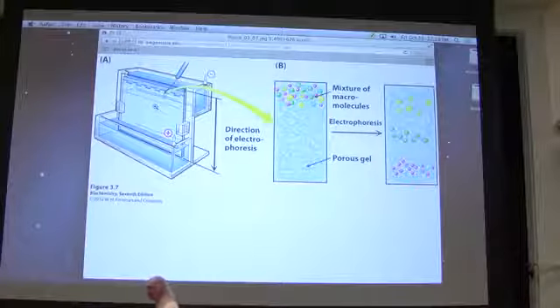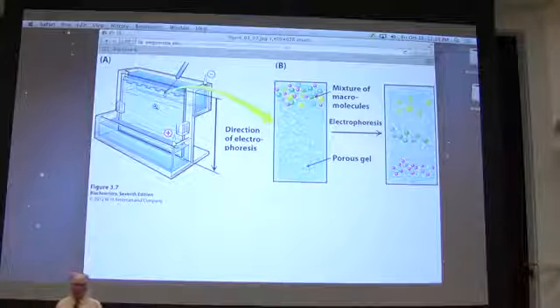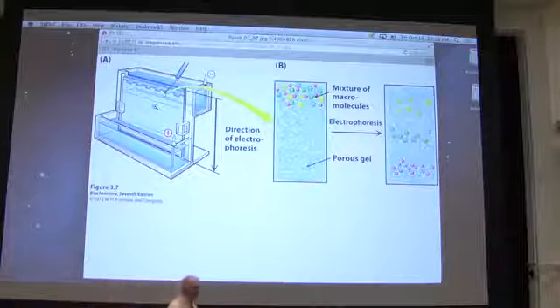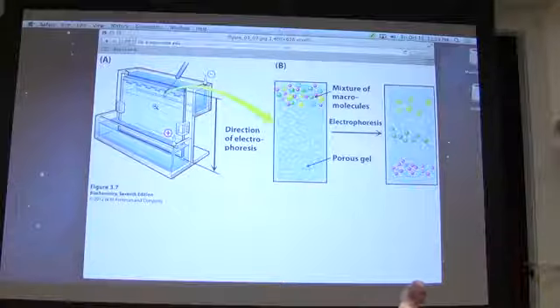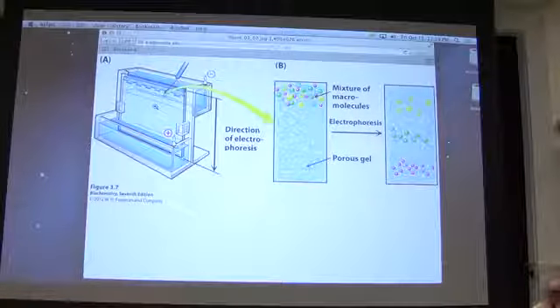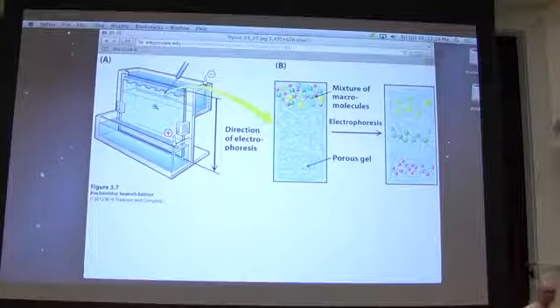Why do we make them with smaller holes? Well, primarily because we use polyacrylamide gel to separate proteins. And proteins are much smaller than DNAs. If we don't make this pore size small enough, we're not going to have a difference between large and small making its way through.